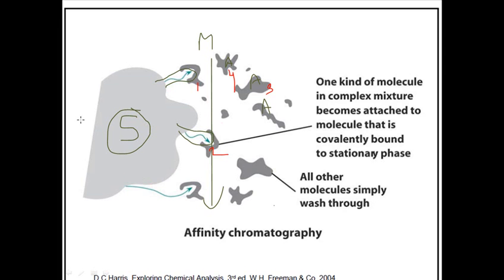So they bind with the stationary phase, but all the other antibody molecules cannot bind, they pass through it, so they elute faster. So again we are using the partitioning capability between the stationary phase and the mobile phase. Using the analyte in the middle, we can separate them. So this is the basic way of separation of all these things.